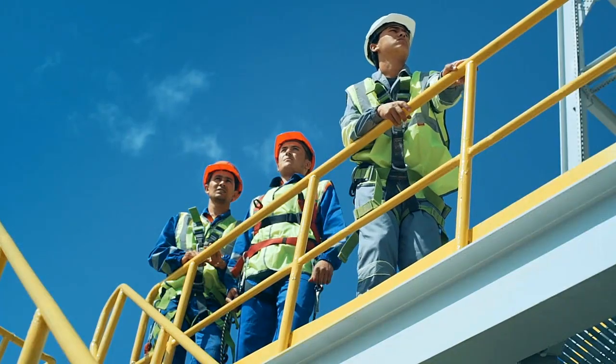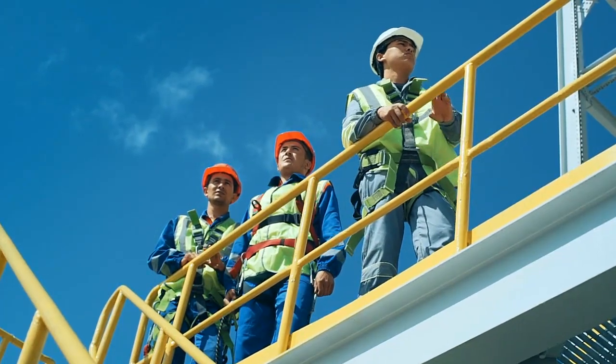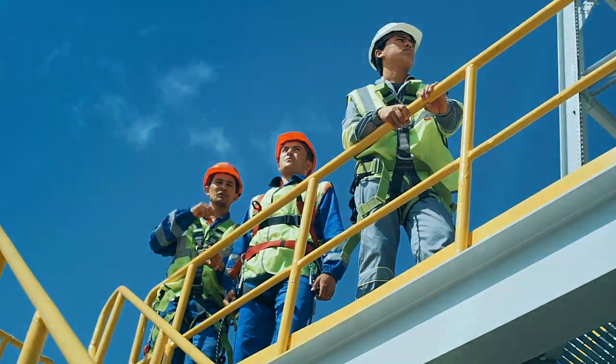With our breakthrough technology, you can optimize your crude oil processing for better quality products and increased profitability.